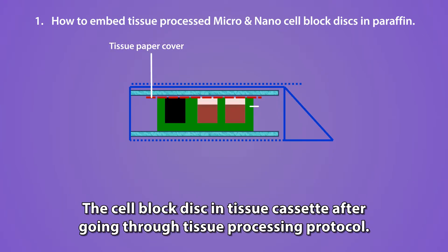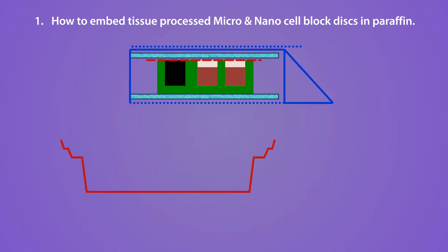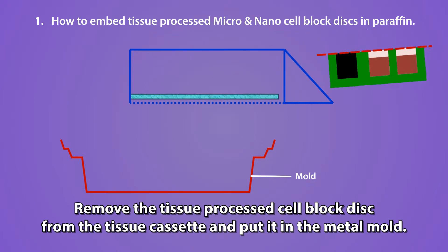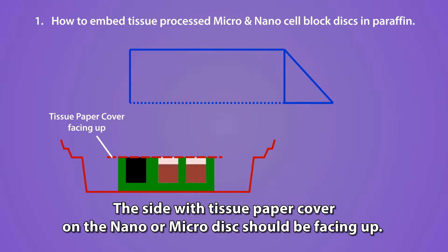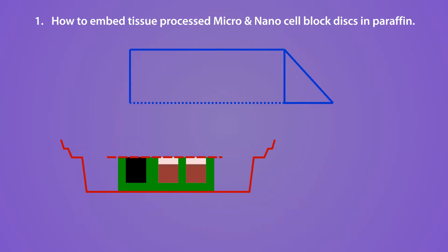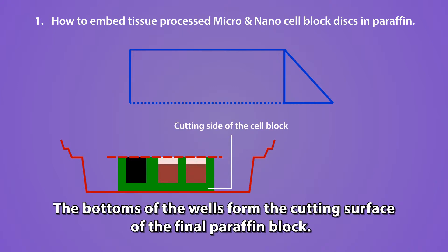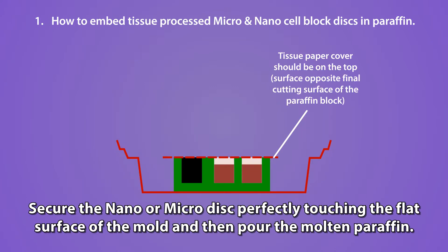After going through the tissue processing protocol, remove the tissue-processed Cell Block Disc from the tissue cassette and place it in the metal mold. The side with the tissue paper cover on the Nano or Micro Disc should be facing up. The bottoms of the wells in the Nano or Micro Disc, with concentrated specimen, face down — as these bottoms form the cutting surface of the final paraffin block. Secure the Nano or Micro Disc perfectly touching the flat surface of the mold, then pour the molten paraffin.